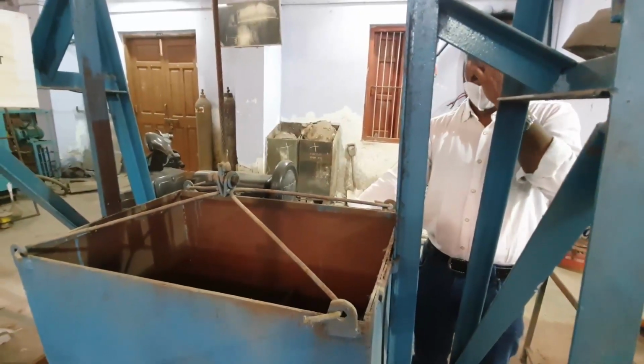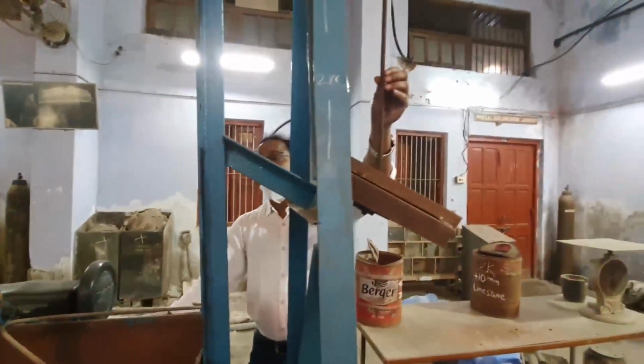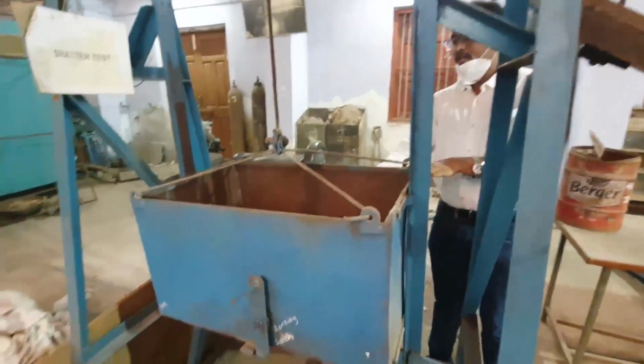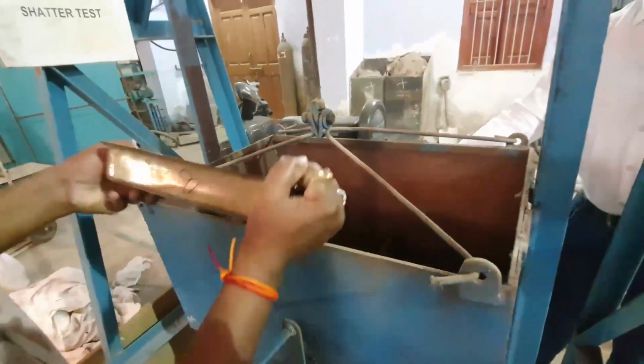What we have done, we have brought this drum down by this pulley arrangement. So now it is at this height. We are loading the raw material, iron ore.